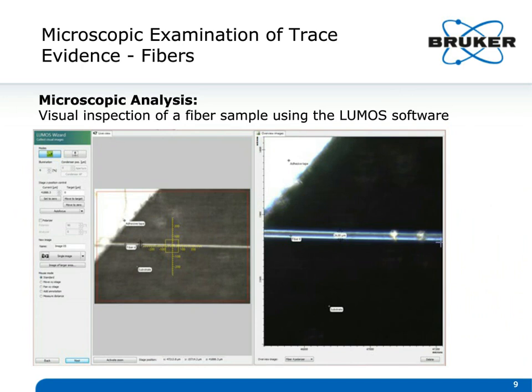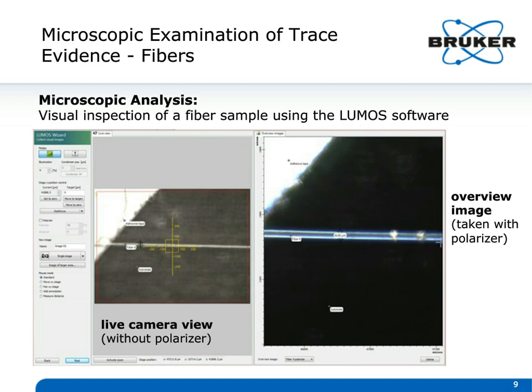For looking at microscopic samples, you can actually visualize, in this case, the object of interest. And here is a small fiber. And you can see that not only do you want to use the bright field image shown on the left, but also you could use polarized light that can give you information about microburrs and microfibers. There are many forensics examples in the literature where looking at fibers has been important, and particularly doing infrared and visual microscopy on fibers has been immensely important.